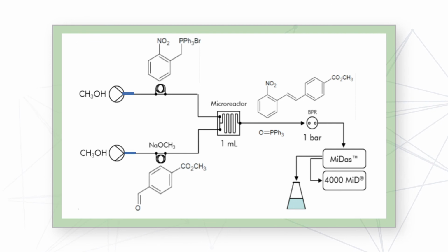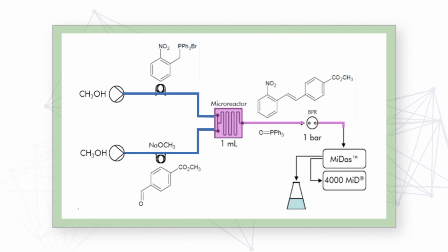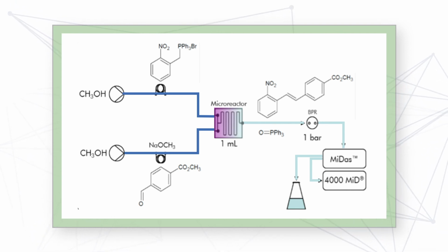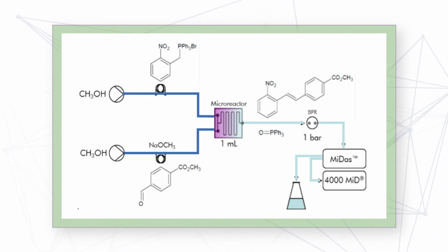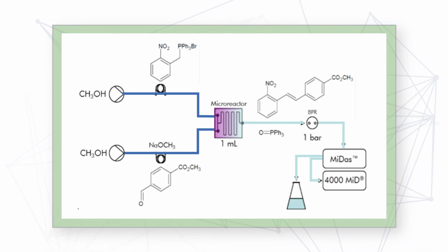The reactants flow from the loop to the microreactor, where a pink-purple coloration can be gradually seen filling the reactor from the bottom. The rate-limiting step of this reaction is the ylide reacting with the methyl formyl benzoate, and the pink colour therefore fades as the reactants reach the top of the reactor. Eventually, the reaction should reach the equilibrium, where the pink colour is the strongest at the bottom of the reactor and completely clear at the top.